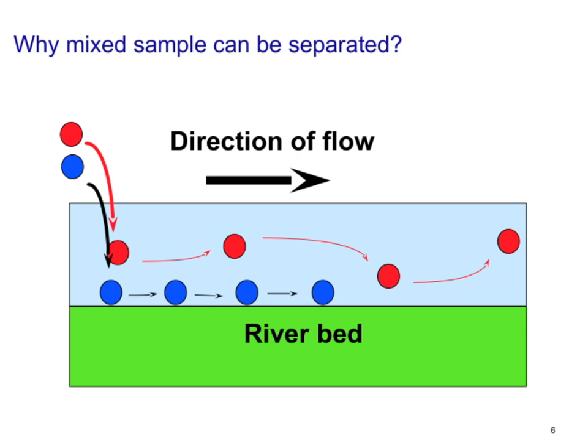Imagine a river bed with various features, like bends, rocks, and sediments, that affect the flow paths. These features create conditions where different particles are separated naturally. This is why understanding the river bed and flow direction is key to grasping how separation happens.